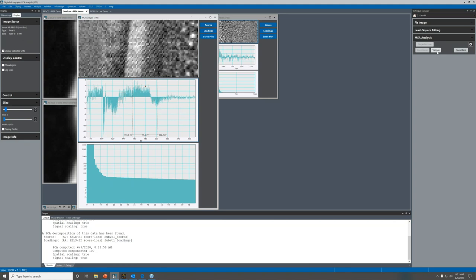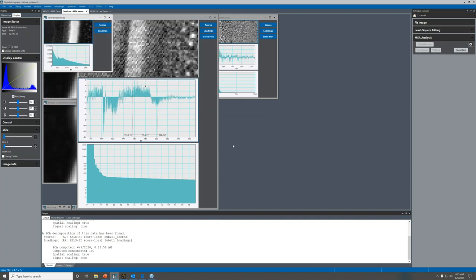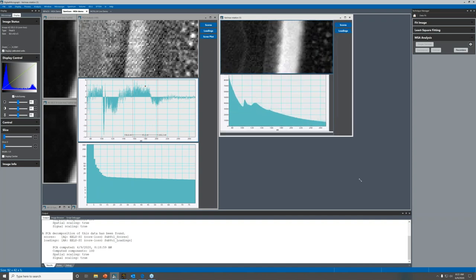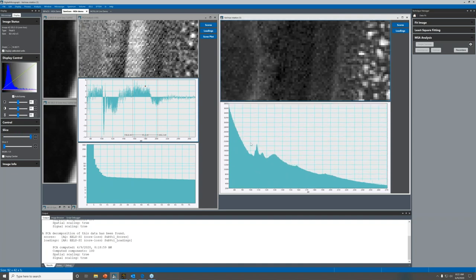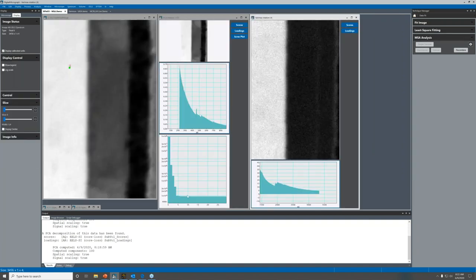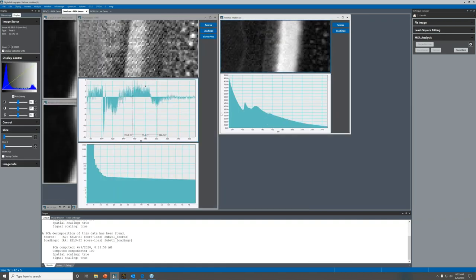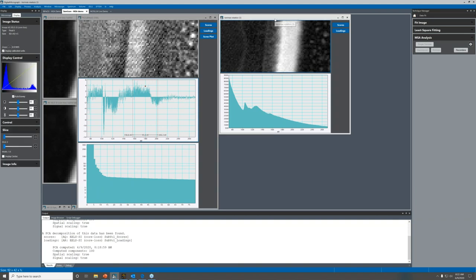Let's do a VaryMax with five components. We end up with some nice maps and five different spectral signatures for the silicon L2,3 edge in this sample — different layers and little precipitates. This illustrates that for easy cases you might think you can decide just from the scree plot, but for something with a less sharp scree plot, it's important to actually do the decomposition, look at the scores and loadings before deciding where to do your VaryMax rotation or denoise.